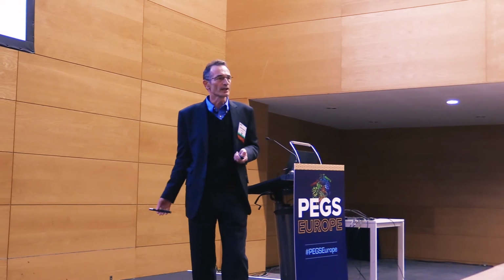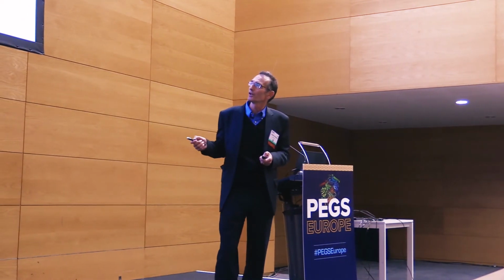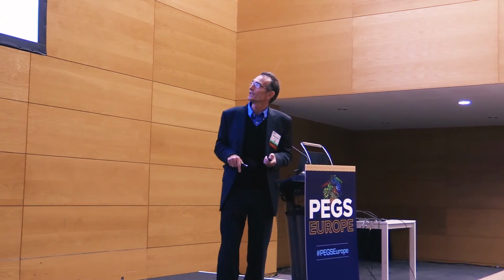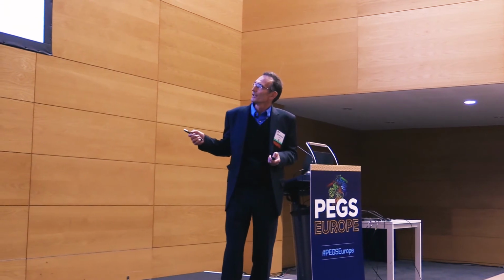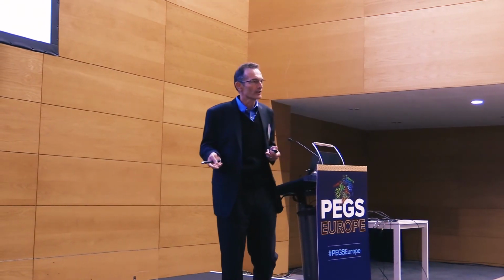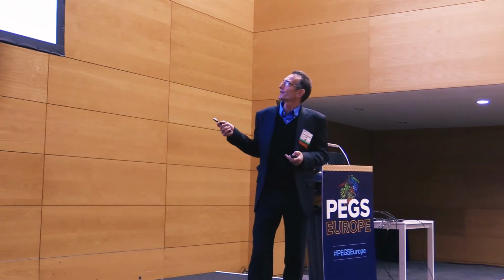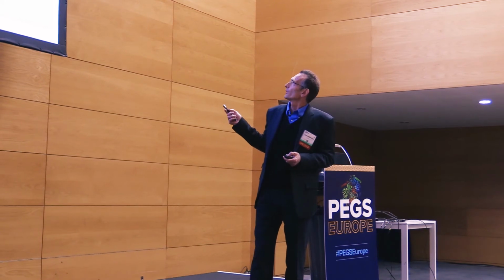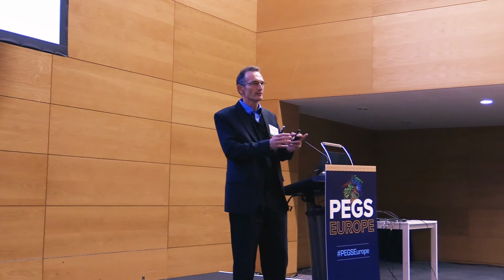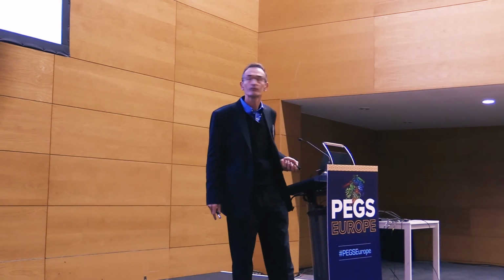What happens when we do selections? The selection platform we use is we start with our phage display library. We do 2 rounds of phage. We then transfer over to yeast. This allows us to sort for the highest affinity and also best expressing clones. And then we do NGS on the output and do machine learning to identify different clusters. The idea is to pull out antibodies with different paratopes likely to bind different epitopes in a target.